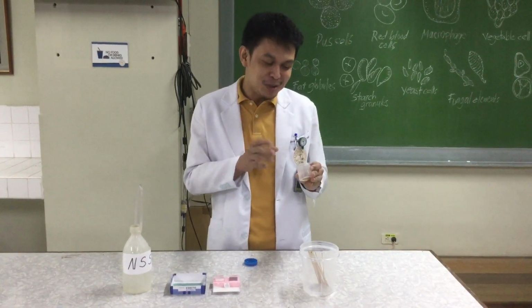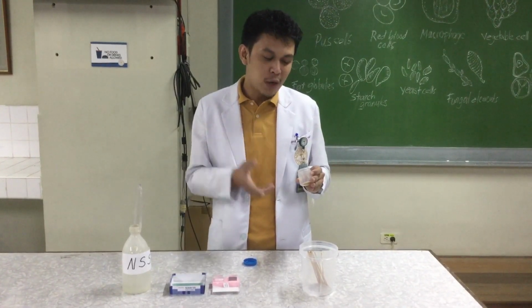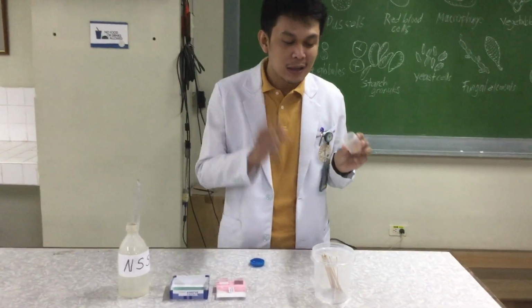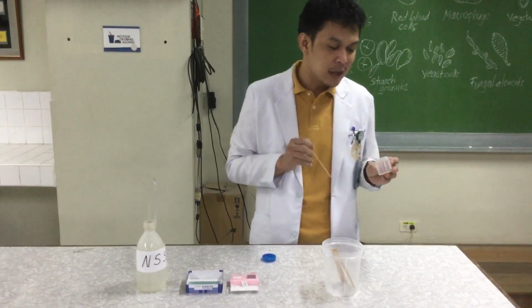So in order for you to know whether the stool is really a stool, you examine it with your naked eyes. You need not smell it, you need not touch it, and most of all, you need not taste it. Take note of the consistency, whether it is soft, watery, formed, or semi-formed, and also the color. Again, less than 30 minutes. If it is watery, just like this one, it should be transported to the laboratory in less than 30 minutes and examined immediately.